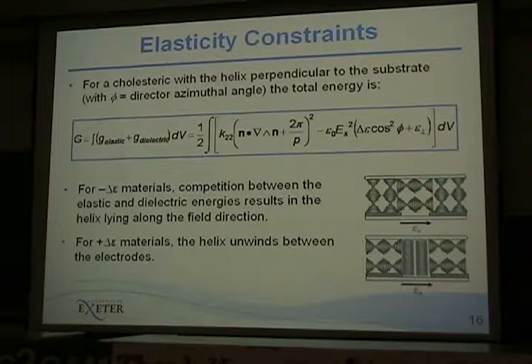It's something that may be important for the display industry, with pixels getting closer and closer together for high resolution devices. The effective stray fields can be considerable, and it's not until 3D imaging techniques like this and the other techniques that we've heard earlier today that we can actually look inside and physically see what's going on inside this liquid crystal cell and what effect it actually has on the director. And I just want to say that we're hoping to do a more detailed analysis of this with collaborators at Case Western University in Ohio. So hopefully we'll get this completely sorted soon.